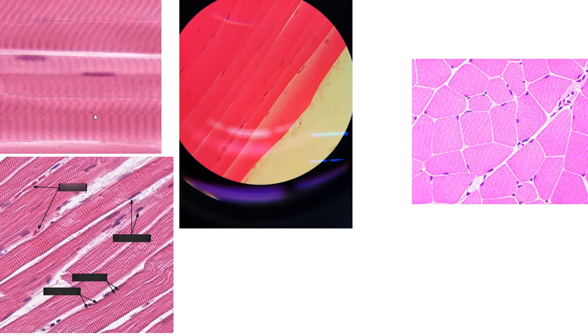Moving into muscle, this is skeletal muscle. The key feature of skeletal muscle is that you should see these striations in it. So you definitely see it here, you see it here, and if you look closely, you can see it in this one too. This is a longitudinal section of skeletal muscle.